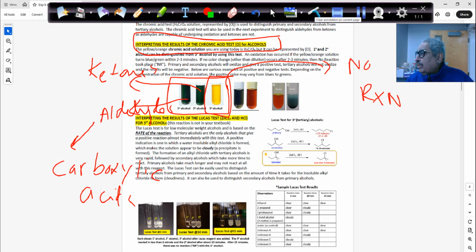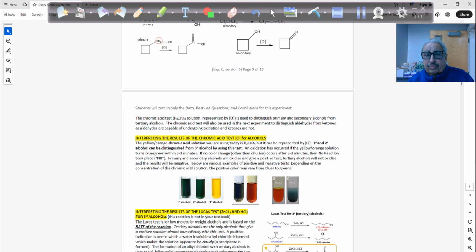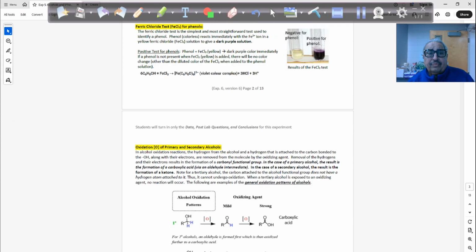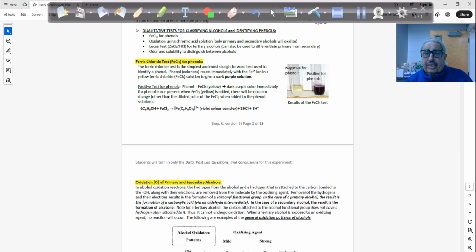Chromic acid is a very corrosive combination of two compounds, chromate or dichromate, with concentrated sulfuric acid. So this is the reaction we are doing. Okay, guys. So let me see if we have any reaction there. Okay, so that's the primary alcohol and ferric chloride. This is typical ferric chloride, typical for what? For phenols.